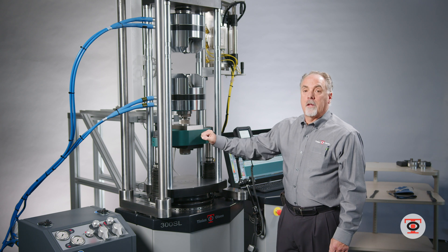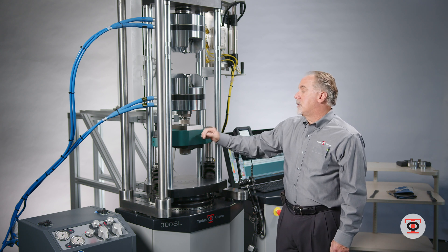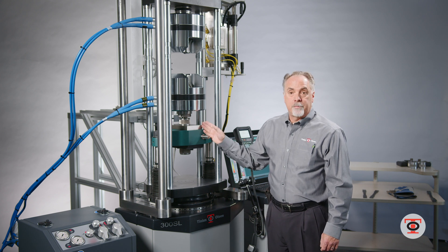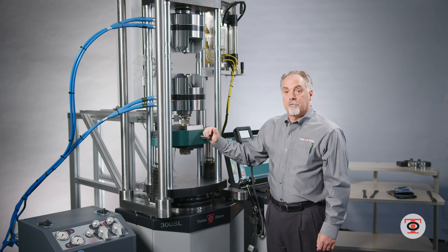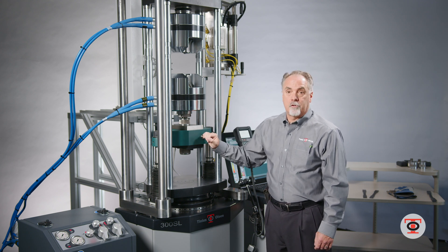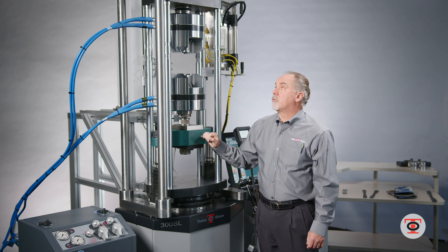This machine, as well as the full SL series, can be configured the same way — you can have hydraulic grips in the crosshead, you can have manual rack and pinion in the crosshead, or you could have hanging hydraulic grips attached to the crosshead.